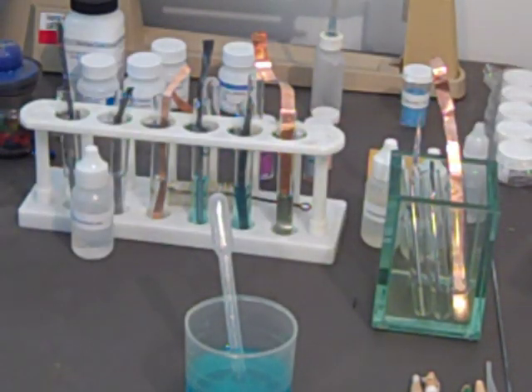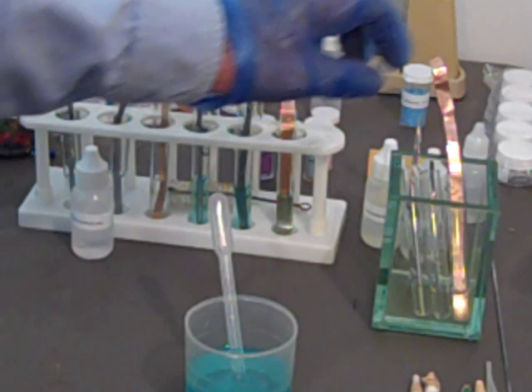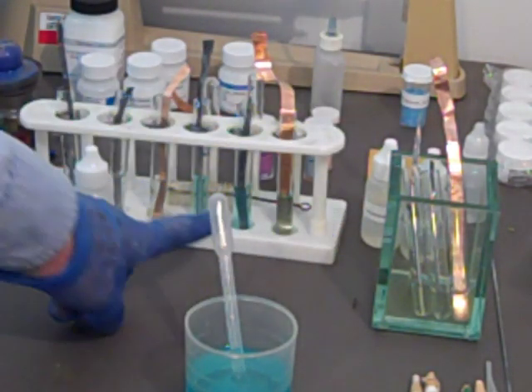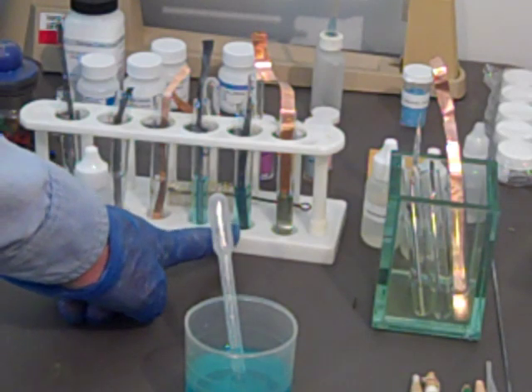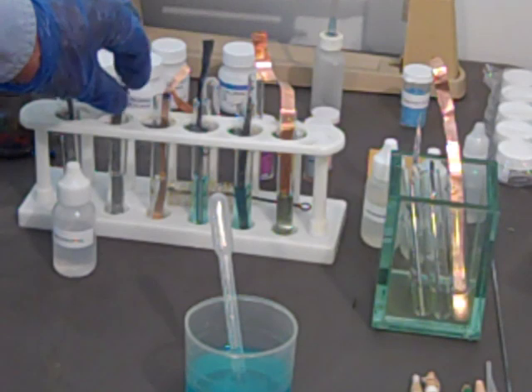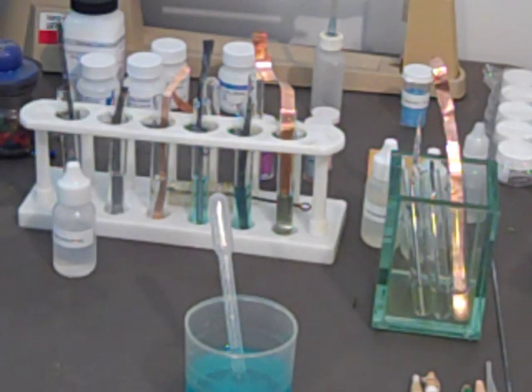We're going to look at it initially and see if there's been any change right away. I don't see any in the zinc chloride. There's not supposed to be any in there. But I see something on the lead over here. It looks like it's blackened. And the lead here doesn't seem to have reacted. I don't see anything happening with the copper.